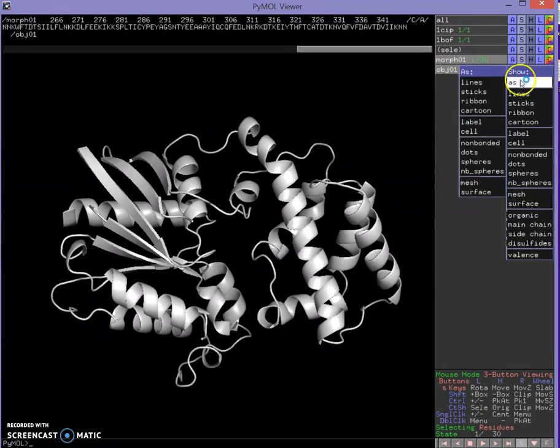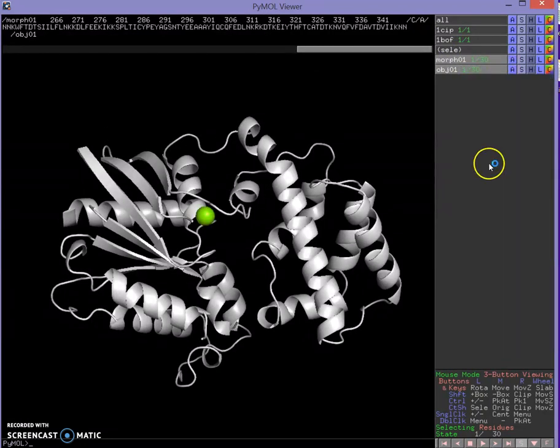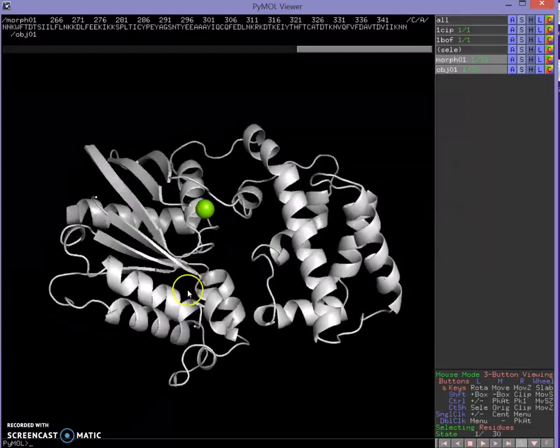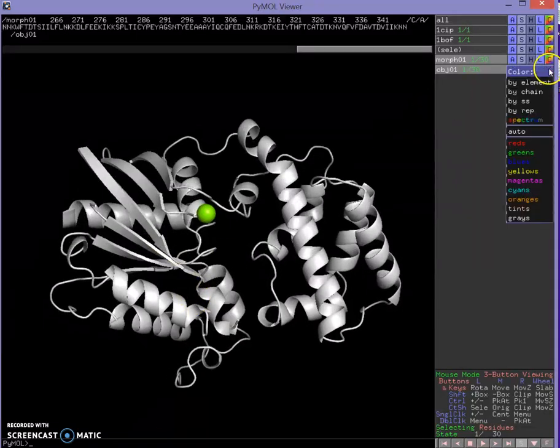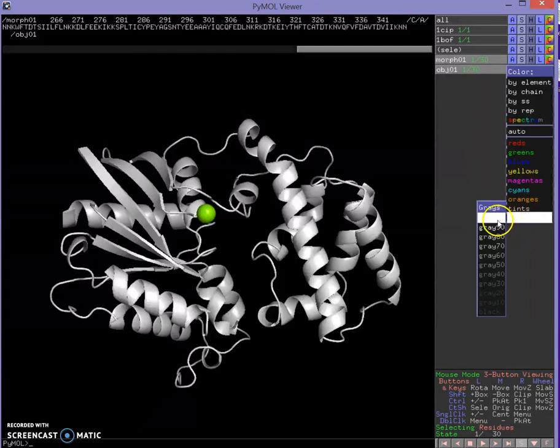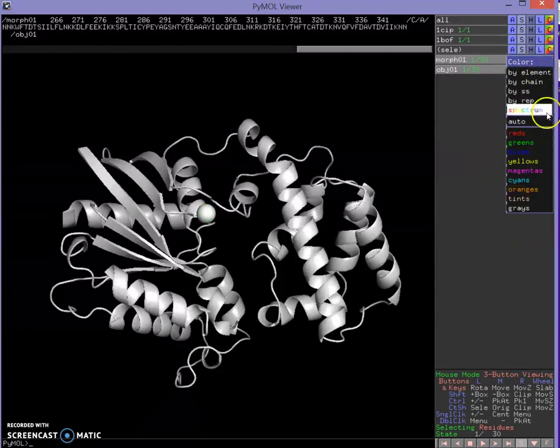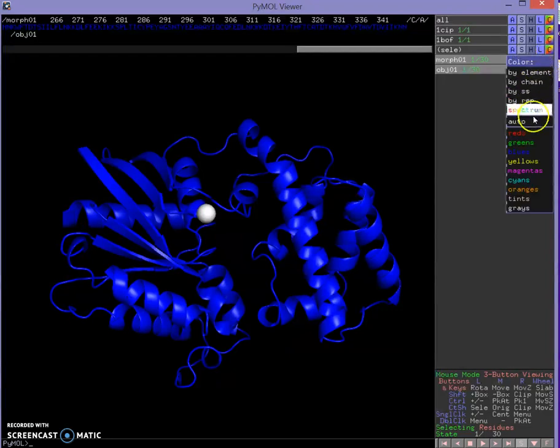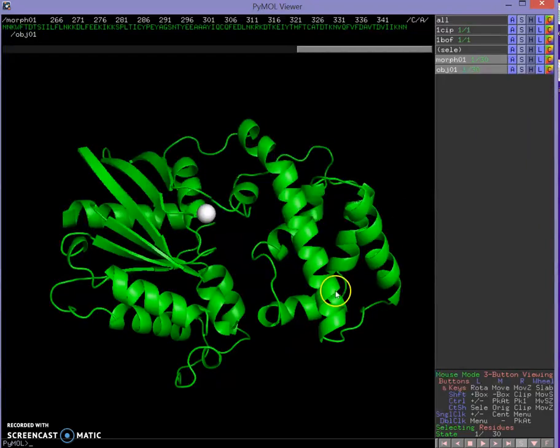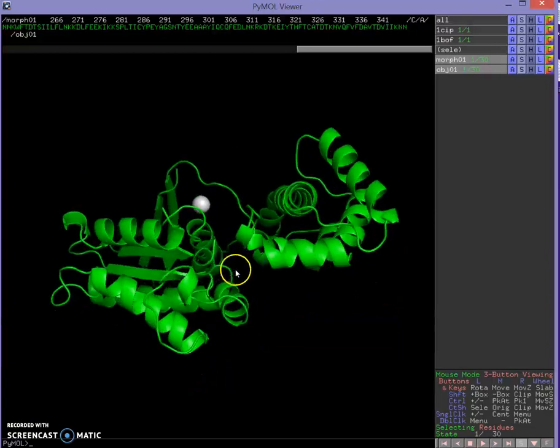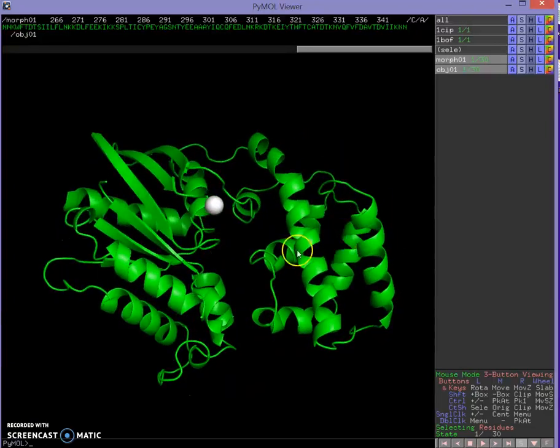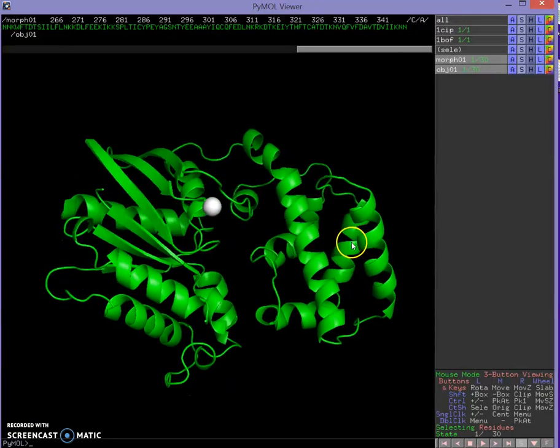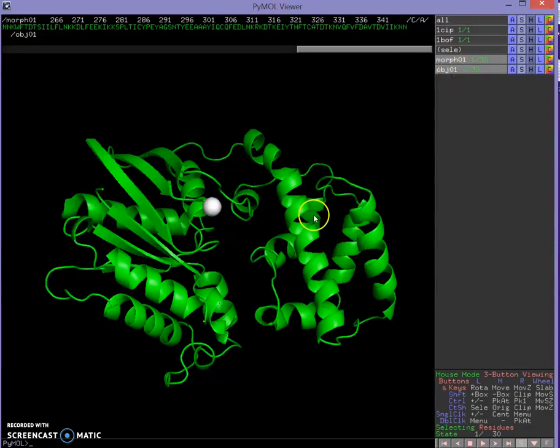We can show that as spheres — there's our little magnesium in the active site. I'll color that white. And I want to color my morph — let's do green, that looks good. Now we have magnesium shown in our structure and our protein structure shown. We also want to show our GTP and GDP, so I'm going to create an object manually.